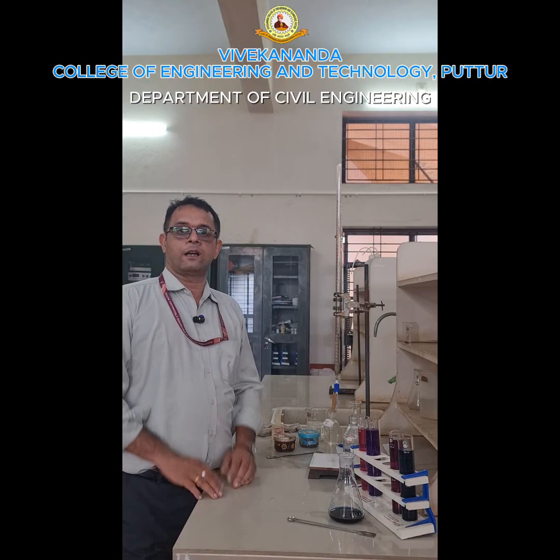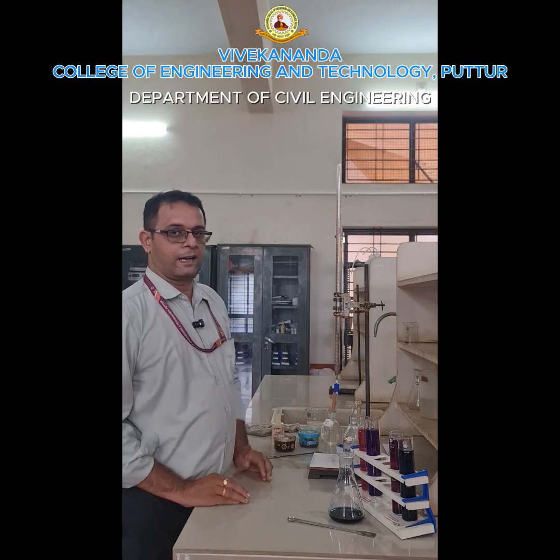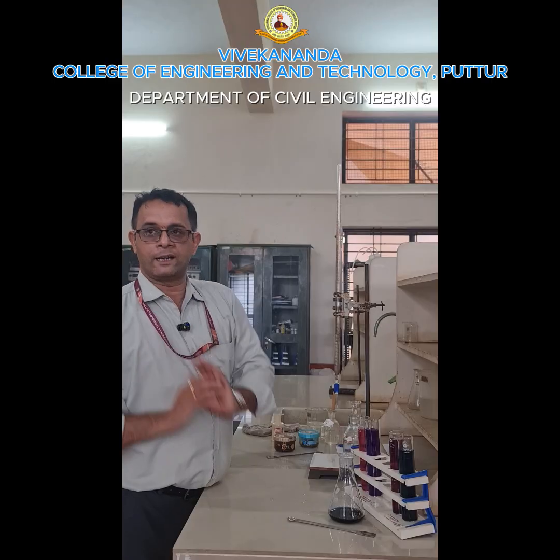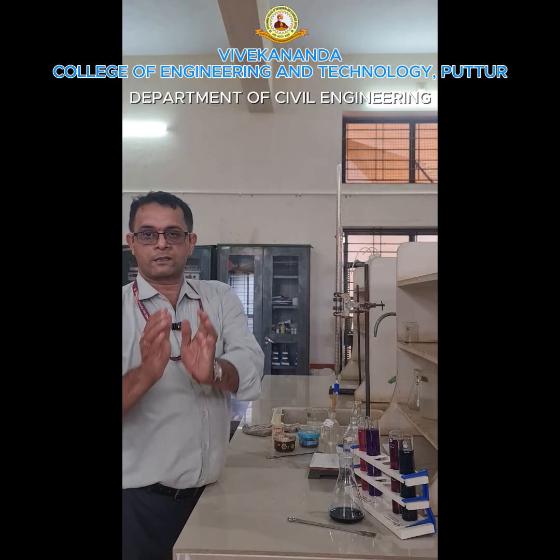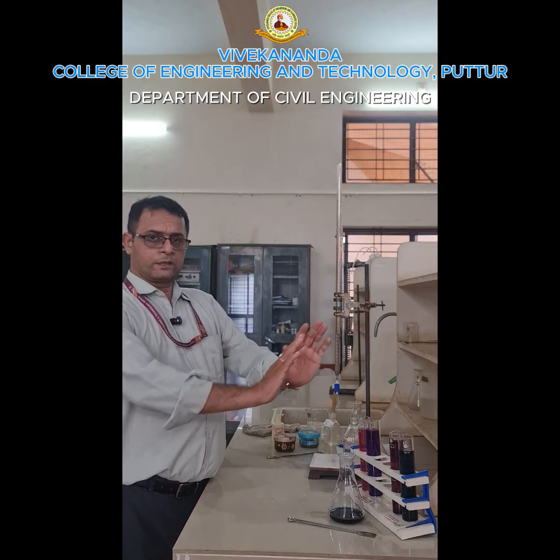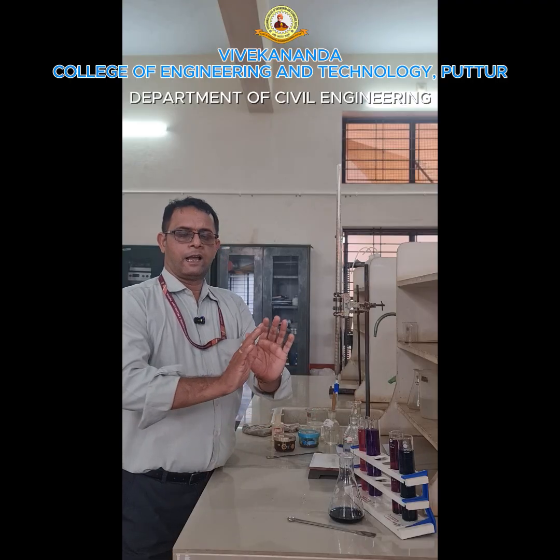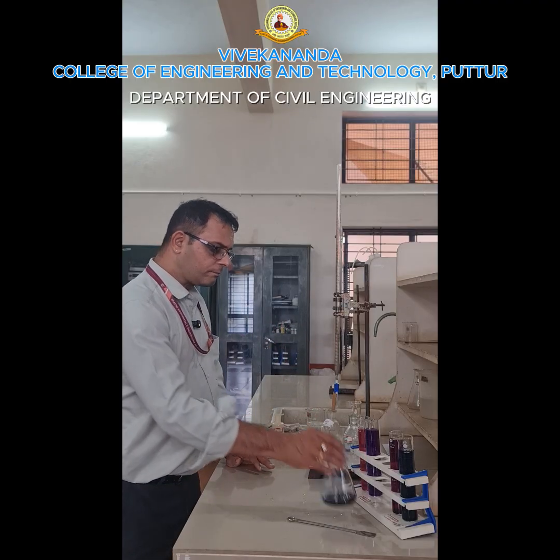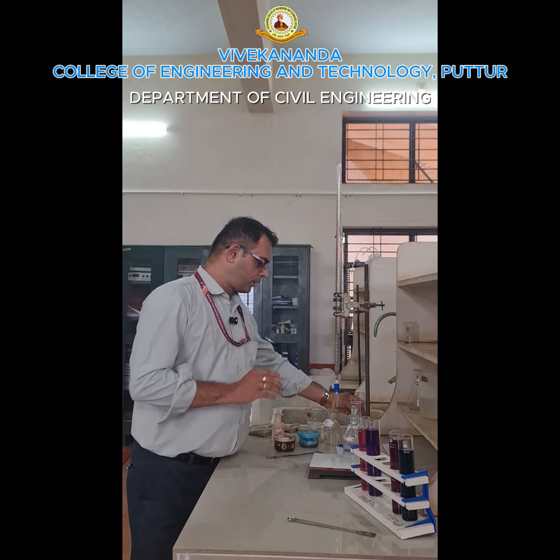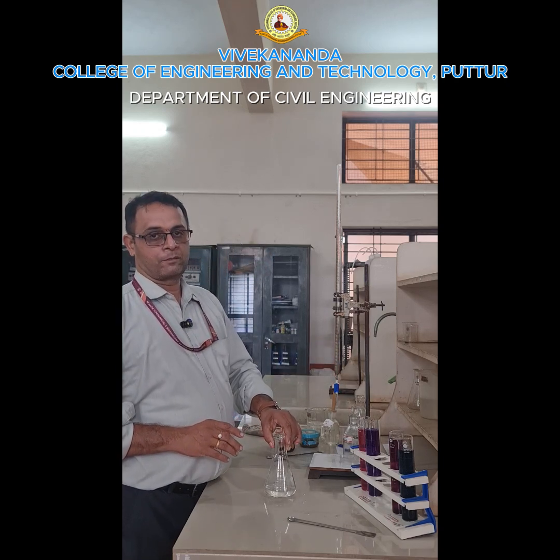Now how to find out the temporary hardness? You have the total hardness and you have the permanent hardness. Total hardness minus permanent hardness will be the temporary hardness. So this is about temporary hardness, permanent hardness and total hardness. Next, I am going to show you how to conduct the calcium and magnesium.